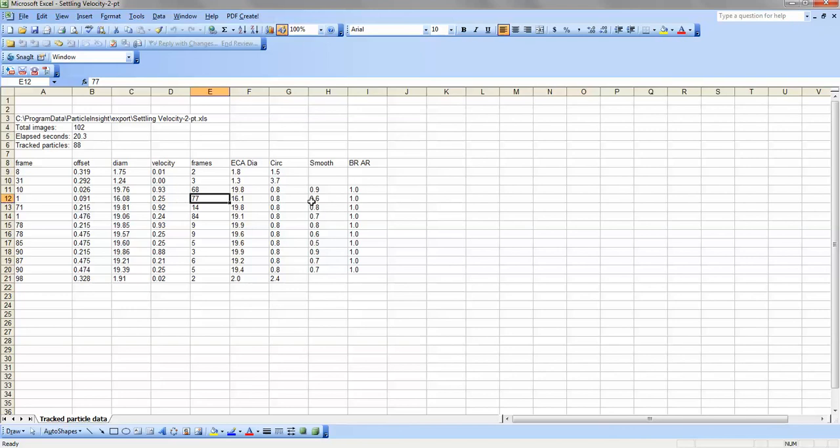You can see, possibly in an array of particles, whether the particles that are smoother, or let's say with an aspect ratio of 1, maybe not necessarily, but let's say the particles had a higher aspect ratio, maybe were more flake-like, if they flowed down slower. If they flowed down slower, they'd have a slower velocity, and they could have a higher aspect ratio. So those are some of the things you can play around with, and that are very interesting with particle velocity. Anyway, I hope this helped. Thank you.